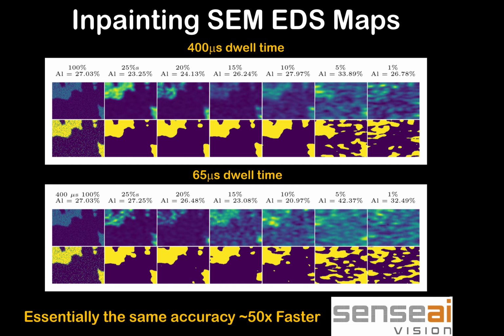And the key thing is you can perform both of them at the same time. There's no reason to do them separately. You don't have to have a change of conditions. We know that we're going to have not quite the optimum to do both at the same time, but it doesn't really matter because we're going to help each one to do the reconstruction.